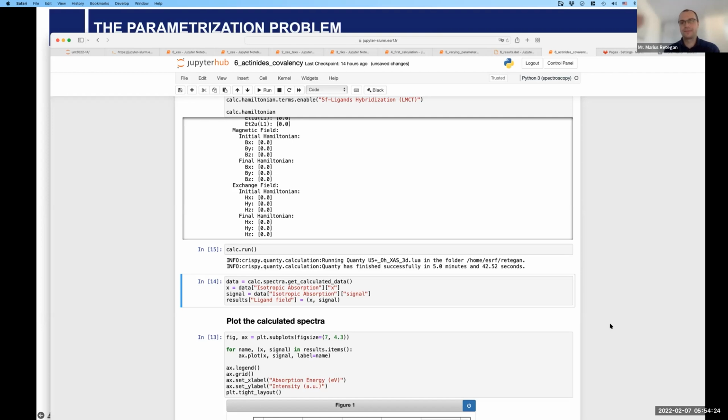But here maybe we have a good example with respect to graphical user interfaces, which is ProXAFS or Pro Quick EXAFS code by Adam Clark from PSI. The only problem is those codes are specialized, tailored to a specific beamline, basically.